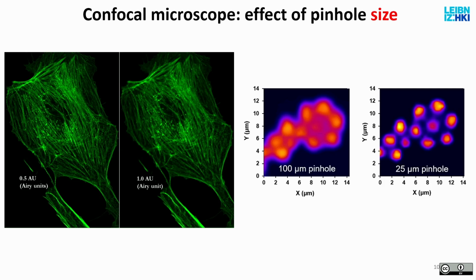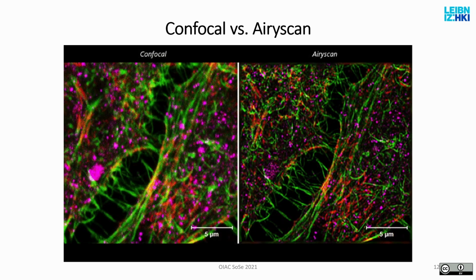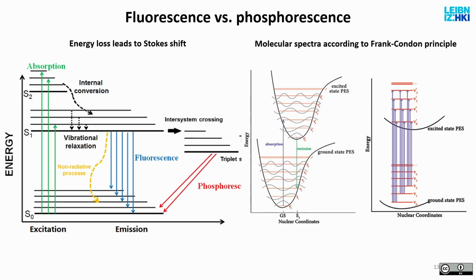So instead, you do that, and then from here on, it's just a question of a few seconds or minutes to analyze the photon signal from each of these mini PMTs and then calculate the theoretically optimal image. Okay, and this is what you remember from the lecture.